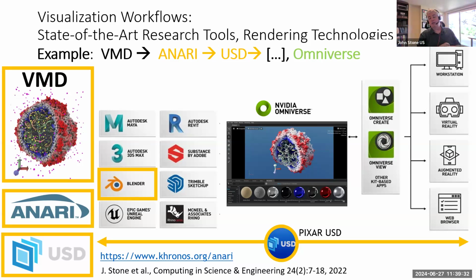One of the things that's interesting about Omniverse is there's a way to have a live link between a tool like VMD and Omniverse. So if you make a change in VMD, it is immediately reflected in Omniverse. Omniverse then also has connectivity to real-time display in VR headsets.